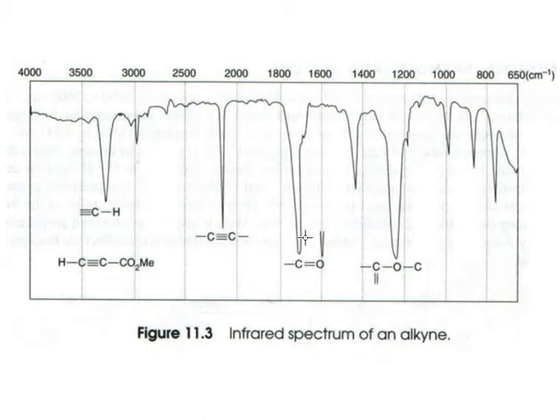Now, one of the bigger peaks is this peak here. It is located at about 1720, and it's caused by the absorption of the carbonyl group undergoing a stretching motion. The C double bond O stretching. We mentioned that that C double bond O stretch produces fairly large prominent peaks. What that means then is that during the course of a carbonyl stretching motion, there's a significant change in polarity, producing a larger peak, resulting in more photons being absorbed. Now these peaks on the right are bending peaks.